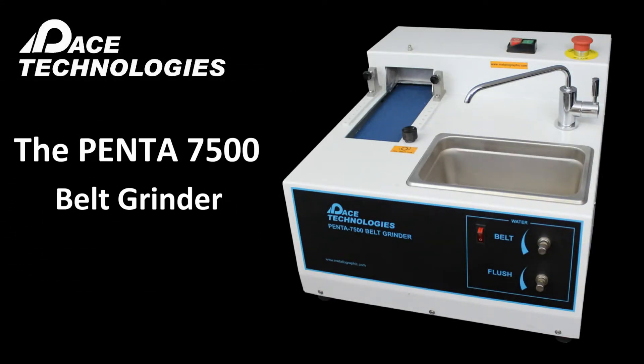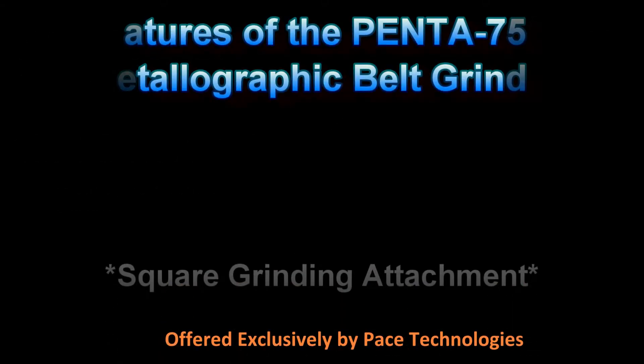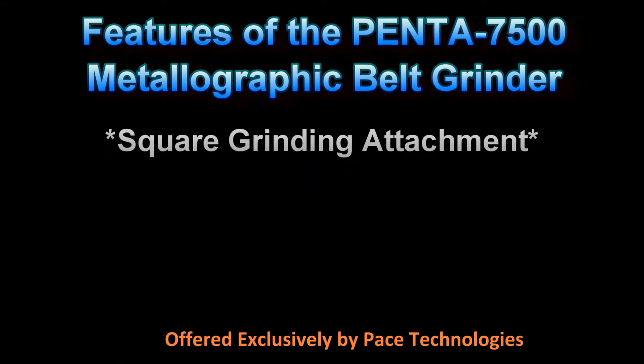The Penta 7500 is a metallographic belt grinder. It is the only metallographic belt grinder that has a square grinding attachment. This allows for fast, coarse grinding and keeps the specimen square and planar.